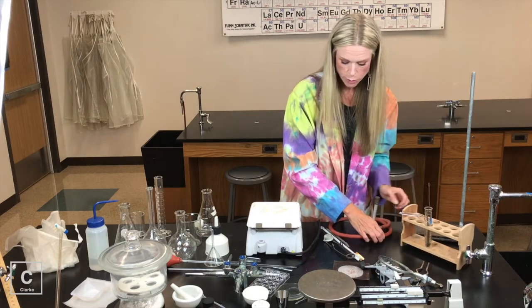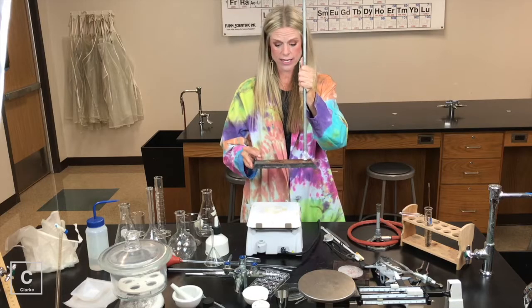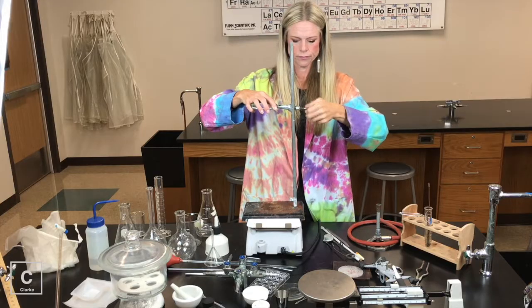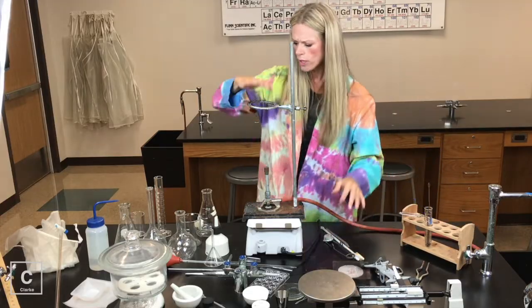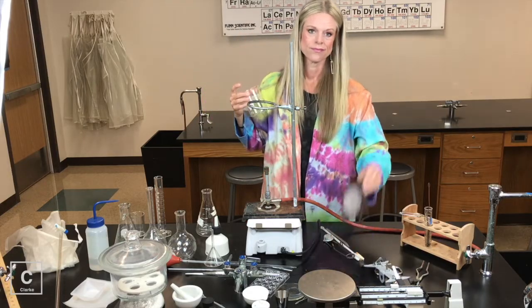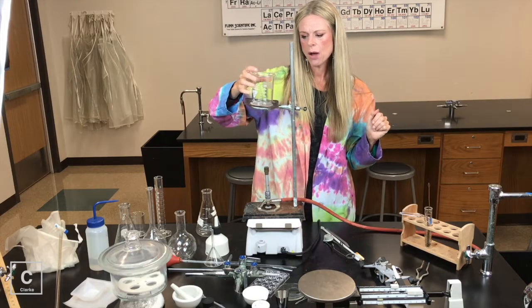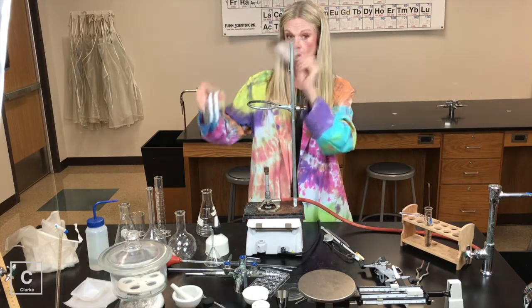Here's another really, really important piece of equipment — a ring stand. Most all of our chemistry apparatuses are going to start with a ring stand. We're going to use a ring clamp to hold things above our fire — so we could have our Bunsen burner here, our ring clamp, and then put a beaker there to heat up a solution. Wire gauze is used like a pot holder. We would use this on top of the ring stand to create a stable situation for heating whatever is in our beaker.